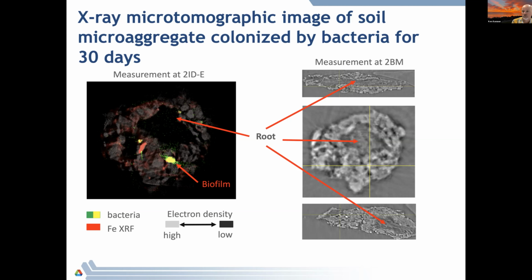So we now can get a rough idea of how long it takes microorganisms to swim and get into the aggregate. We also did another experiment where instead of taking the soil aggregate and dropping it and wetting it for 24 hours before adding the bacteria, we took a dried aggregate, dropped it into a solution that already had these bacterial cells, trying to simulate a rain event falling onto dry soil, where the water, you could hypothesize, would be rushing in and moving into these pore spaces rather quickly, particularly relevant to the size of a microorganism.